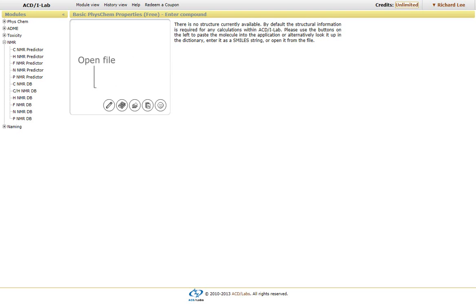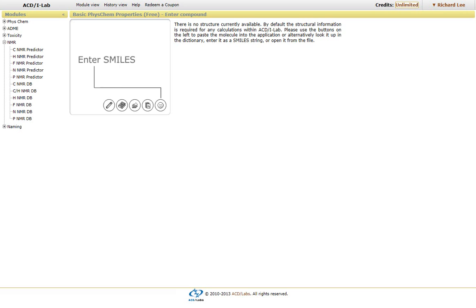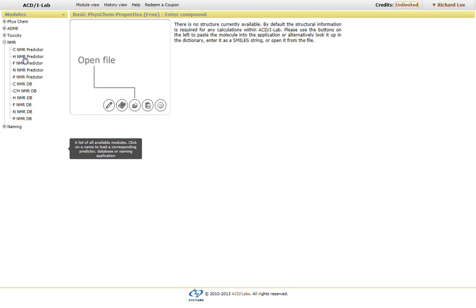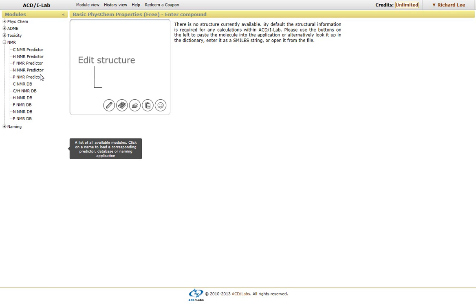This video will describe how to use the ACD Labs iLab interface for predicting NMR spectra, whether it's carbon, proton, fluorine, nitrogen, and phosphorus, as well as their associated databases.